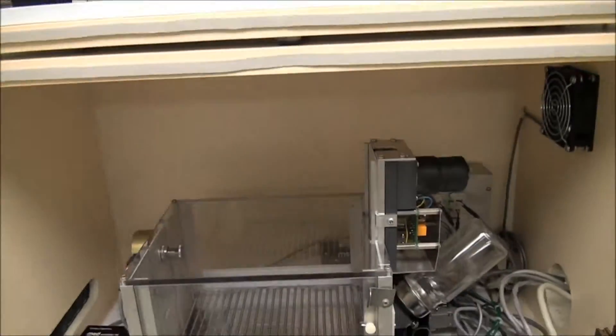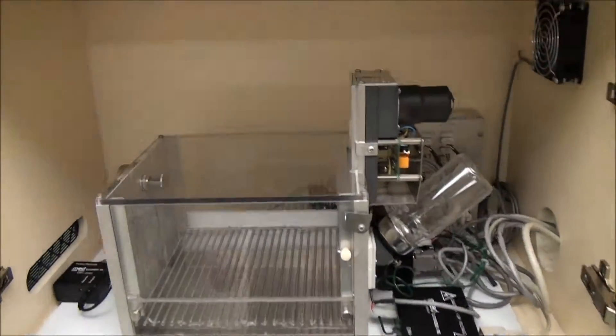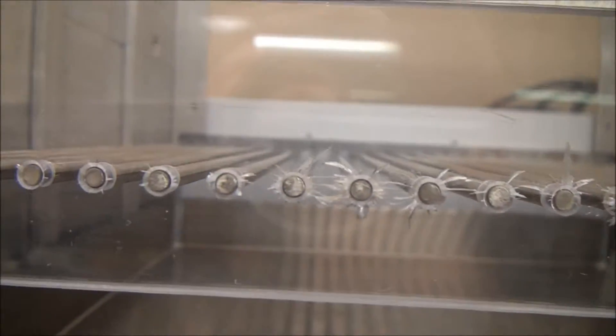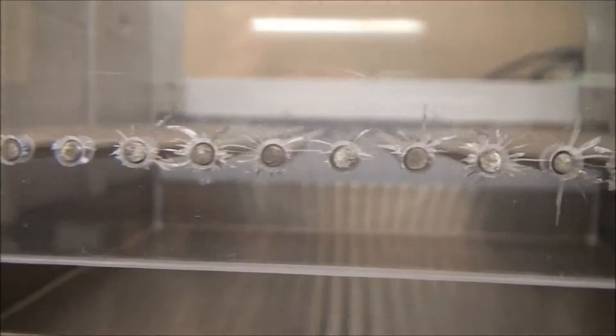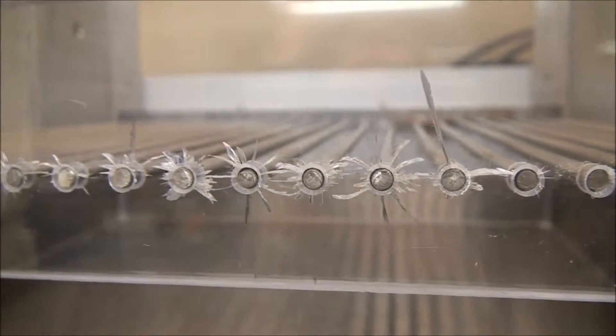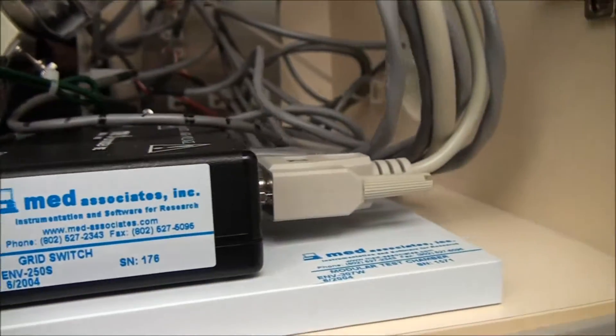We did go through this whole system. And it's really a nice system. Really the only flaw that we've really seen is in the plexiglass here where the rods are inserted. We just have some cosmetic stress cracks in these and it doesn't affect the function of it at all. But that's about all the flaws we've really seen.